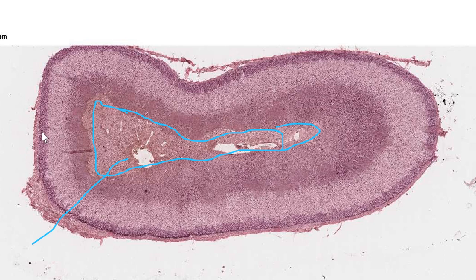So you can clearly see the three distinctions, right? This would be our reticularis. This would be our fasciculata. And then our glomerulosa. This would be the capsule here, all of this that you can see going around, and our apical surface. So there you go. And there's another picture as well. That would be the medulla here, and here, let's draw it out. Medulla and reticularis, just so you can see.